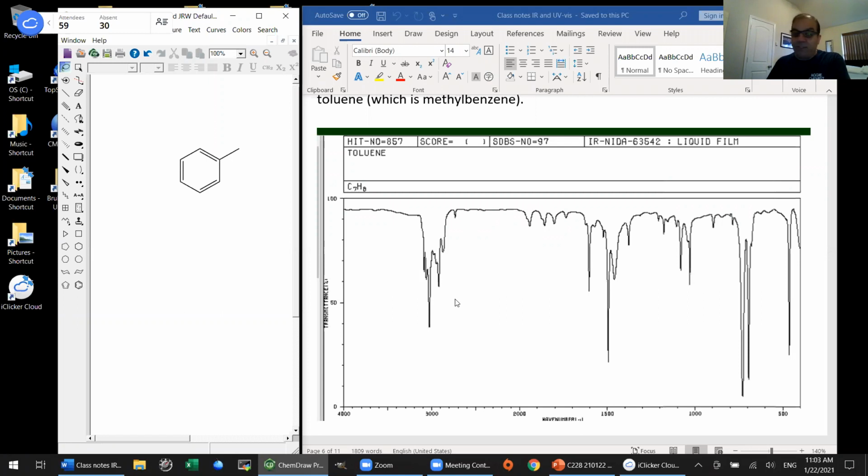Other than that, I don't see a carbonyl, I don't see an alcohol, I don't see a carboxylic acid. Nothing like that is jumping out at me. So what's the difference between aromatic and alkene IR spectra? Usually what I look for is these small, rounded, pretty and symmetrical looking peaks that are not too far below the baseline.